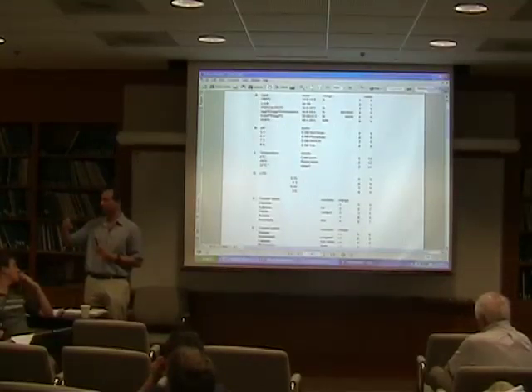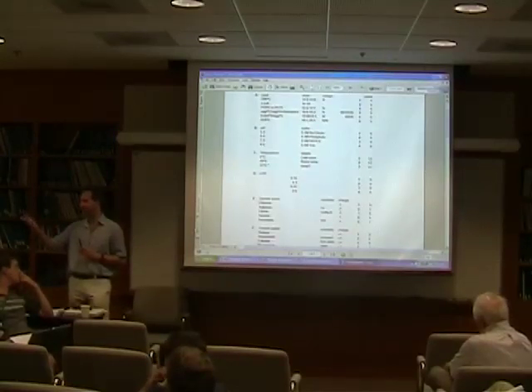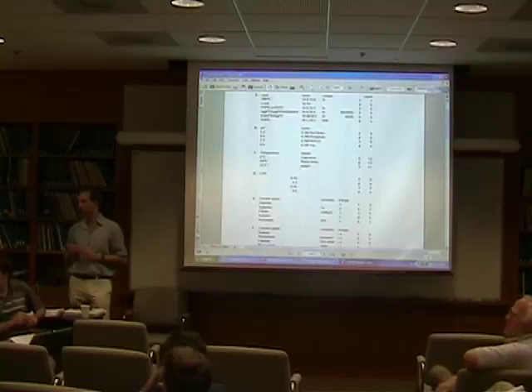Does that work? Well, I haven't tried dialysis that much. Because it's sort of difficult if you get biobeads with great results. Yeah. But you usually don't get very, very high resolution structures.